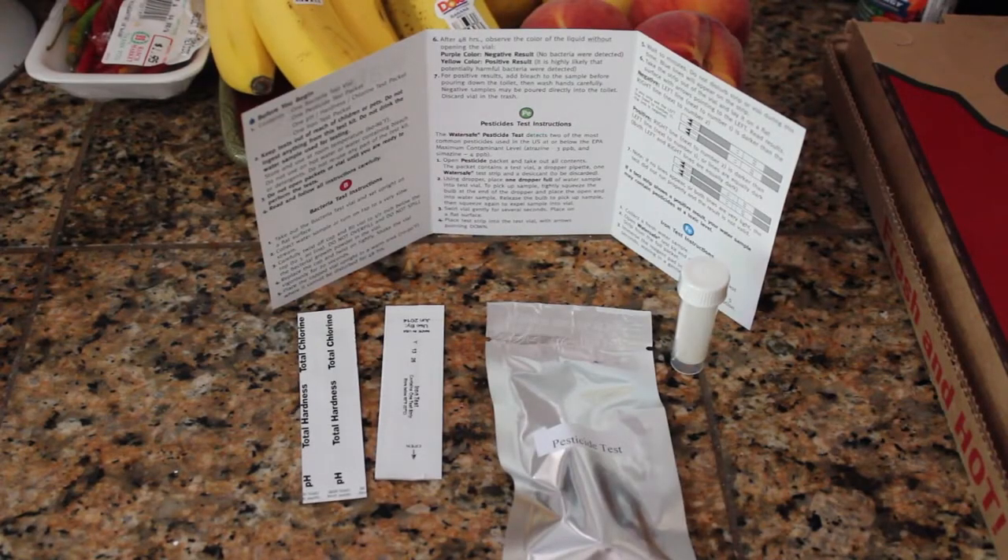When you open this thing up it's got an instruction manual and then it's got four other pieces: a bacteria test vial, a pesticide test packet, one pH hardness and chlorine test packet, and one iron test packet. And then it has instructions for how to operate each of the four, so we're going to go through them one by one.